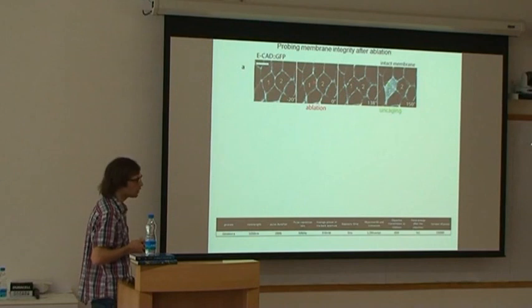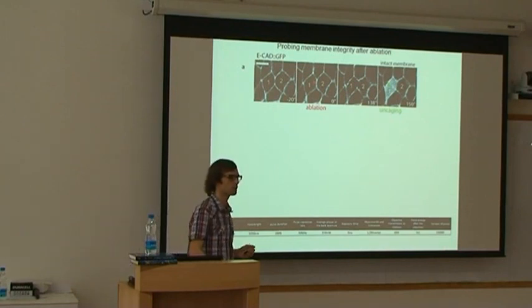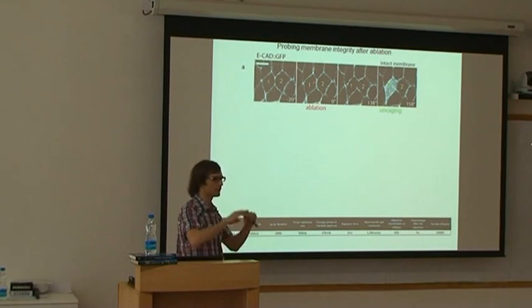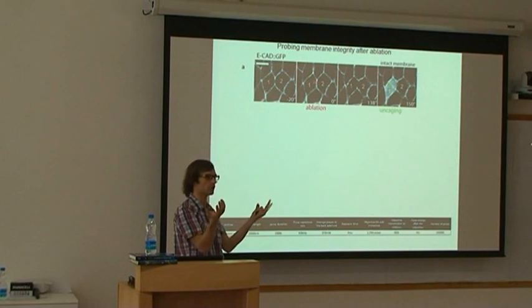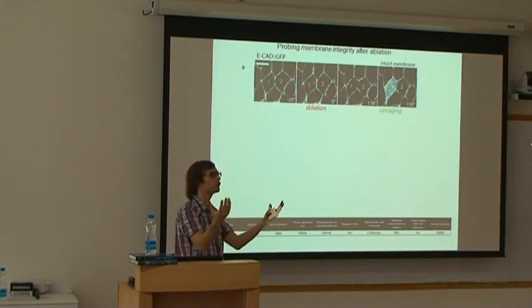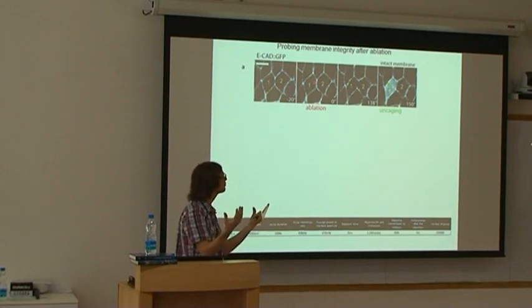And you see uncaging. So what I did was inject in the embryo, at a much earlier stage, a probe that you can uncage. Normally this probe, you cannot see it. It's a very tiny probe that can diffuse very fast. So if you had a completely empty embryo full of yolk without any cells, and you injected this protein, it would diffuse within the embryo in a few seconds. So it's a very, very tiny molecule.